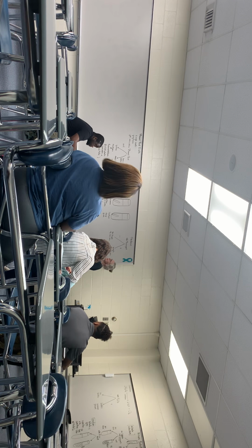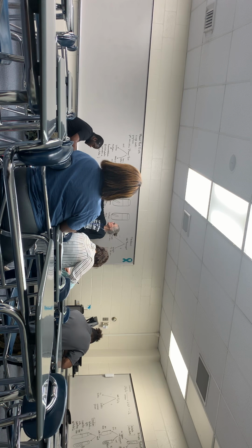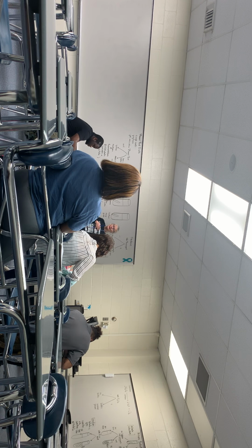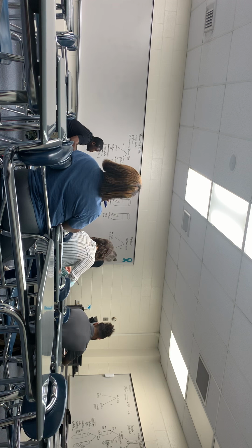So when you come back, you look at the color, and then you look in that Durham's tube to see if there's a bubble in there. So let's say your glucose tube turned yellow with a bubble. So you would read that as acid and gas. Usually in our lab notebooks, we record that as a capital A over a capital G. So that's for acid and gas.